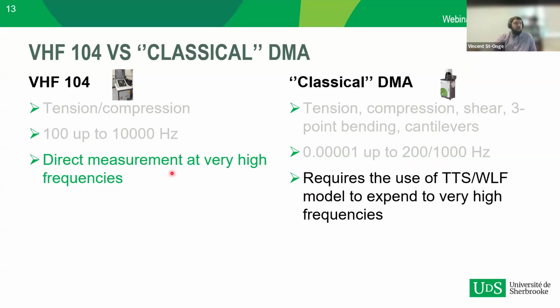If you're interested in looking at the behavior of your materials at higher frequencies, you'd no longer have to use the TTS, or time temperature superposition model, using the WLF equation to mimic, predict, or expand the range of frequencies, which is extremely time consuming, because you have to cool down your samples and take at least 5 different temperatures. So it takes a lot of time compared to a direct measurement.